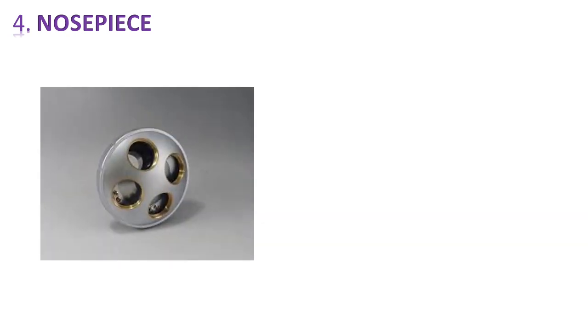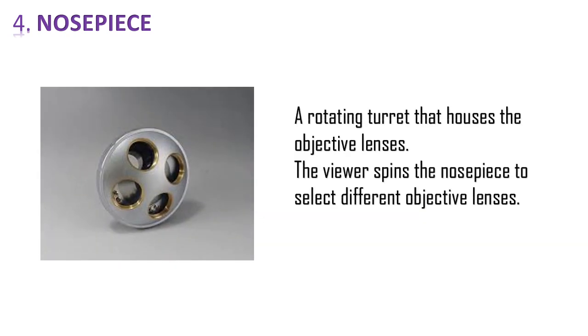And number 4 is nosepiece. And it is used to connect the objectives. It is a rotating turret that houses the objective lenses. And the viewers spin the nosepiece to select different objective lenses of different powers. So we can spin this nosepiece to choose different powers of objective lens.